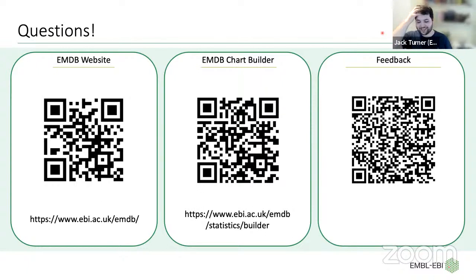So yeah, I can appreciate that. In some ways, this comes back to that EMPIAR metadata file that I talked about, and there are other things that will handle this. You might imagine there are software packages out there which give you an overview of the refinement protocol that you're doing, and all of the programs are imported into that software. I won't name any in particular because I don't know what I can and can't say at this stage. But there are people working to capture all the metadata as you go and auto-generate an EMDB deposition for you right at the end from everything that you've been doing.